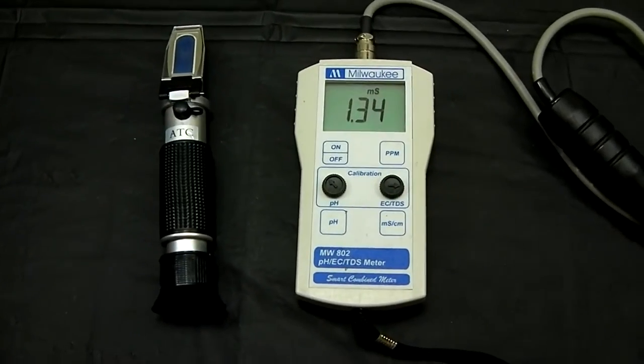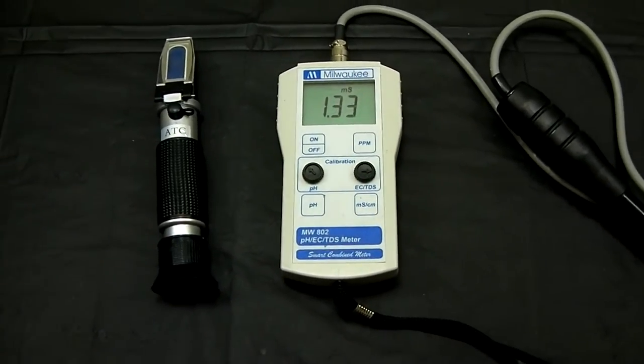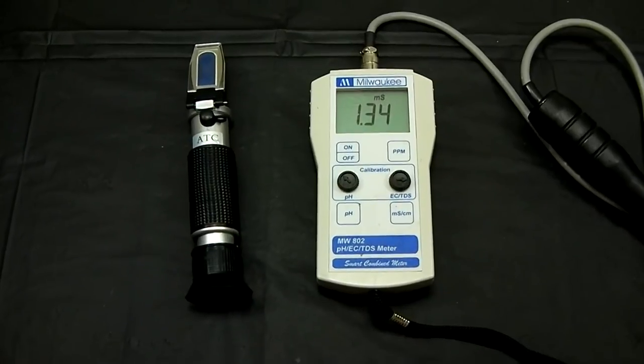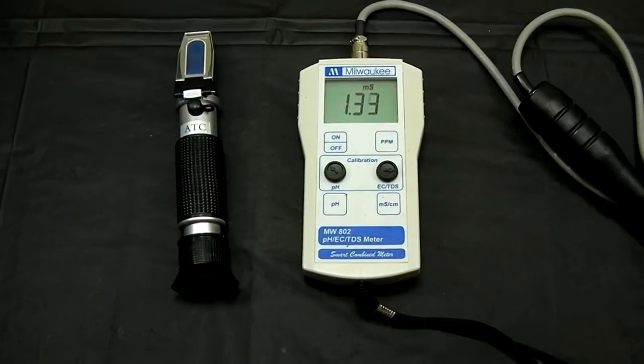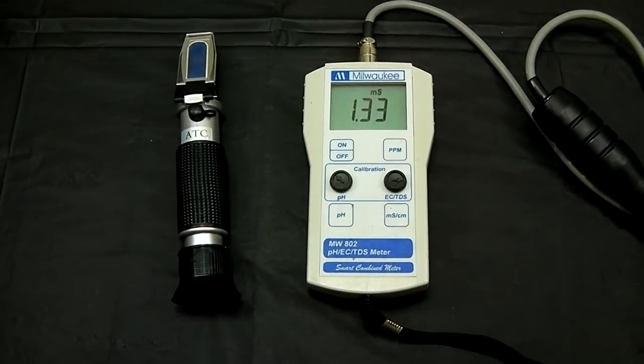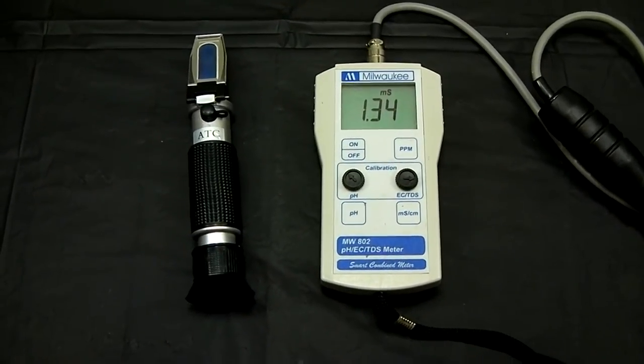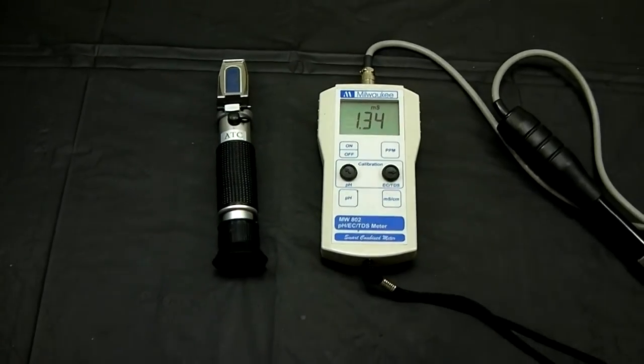You don't have to go out and spend a couple hundred dollars on that meter. You can get a little inexpensive electronic pH meter, or you can even buy the test strips and litmus paper, whatever you want to use. Just check it all the time. But this gives you kind of an ongoing and end result between the two.